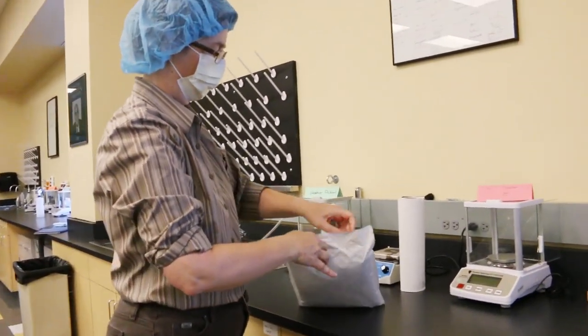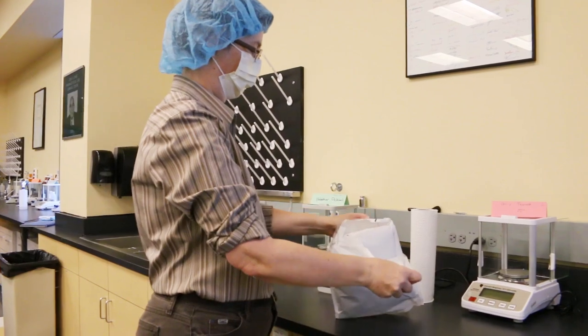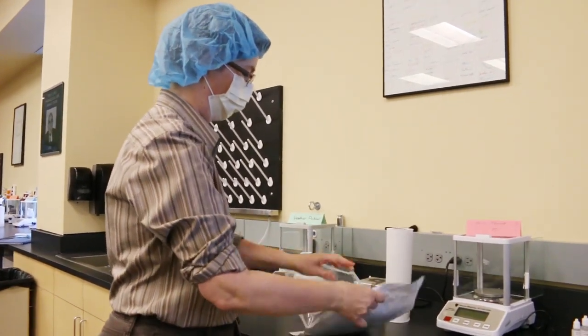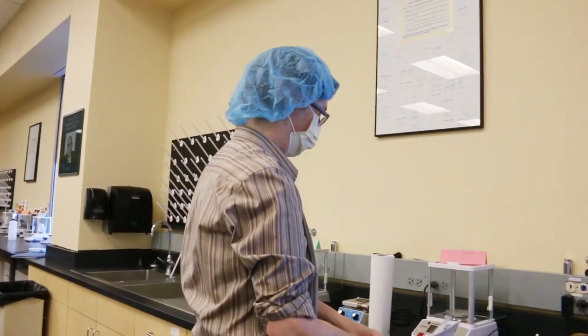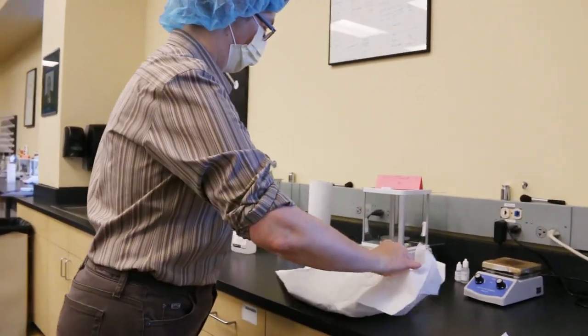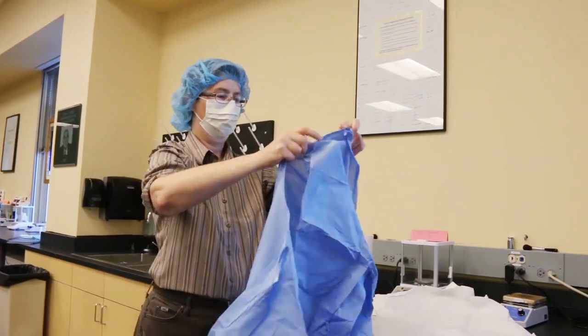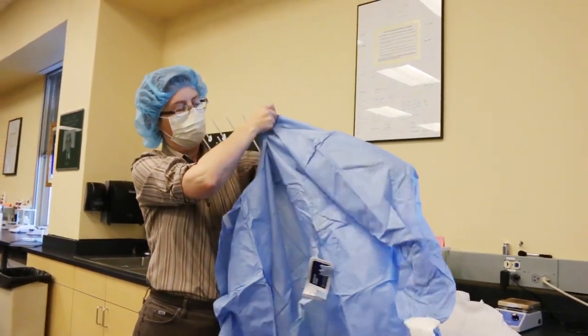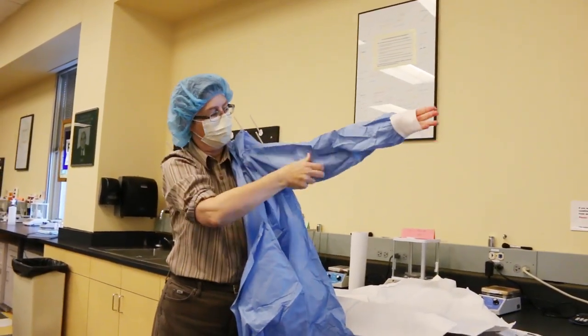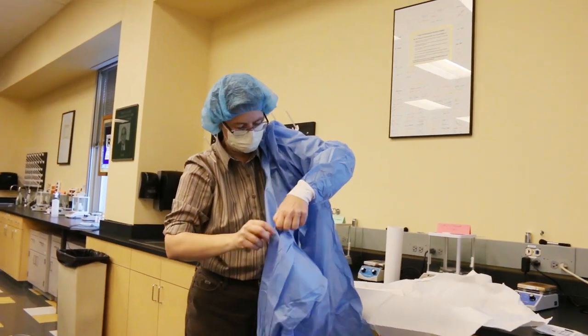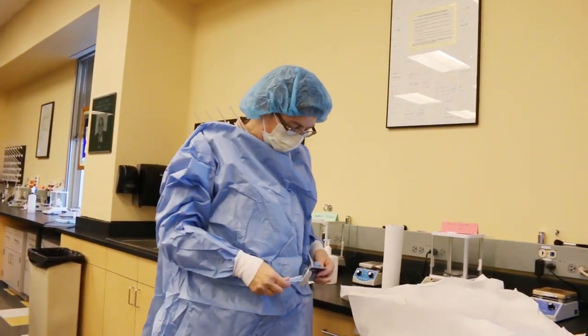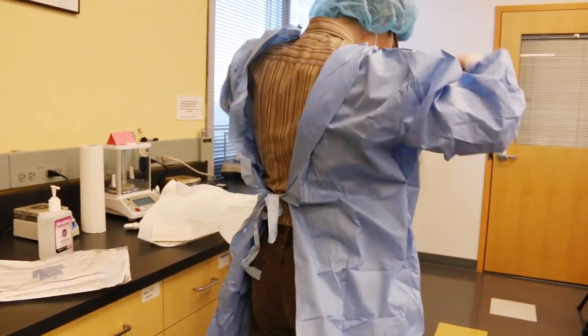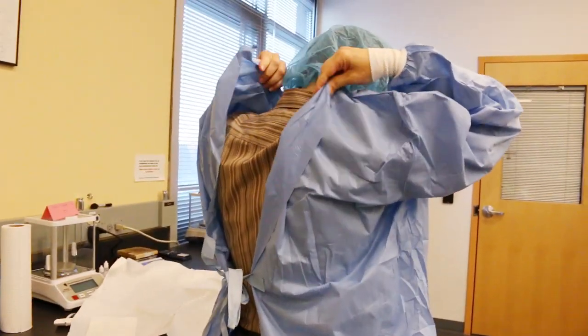Step 20, open your sterile gown package. Step 21A is to insert one arm into the open sleeve and pull it on your shoulder and then repeat with the other sleeve. Step 21B is to secure the gown at both the neck and at the waist.